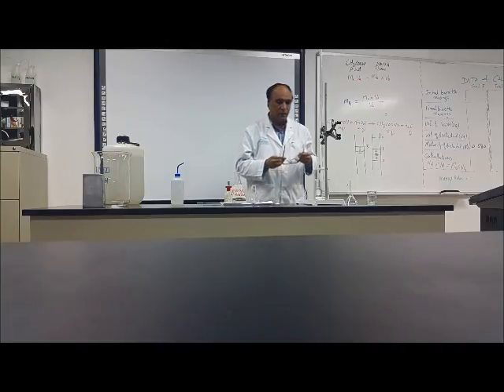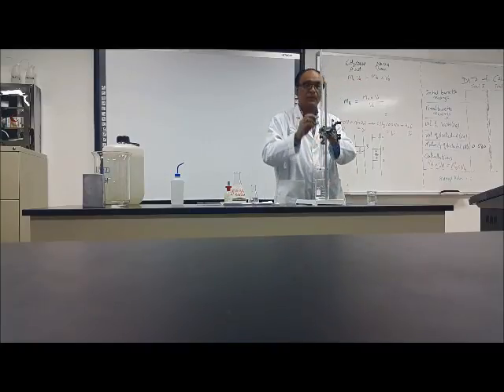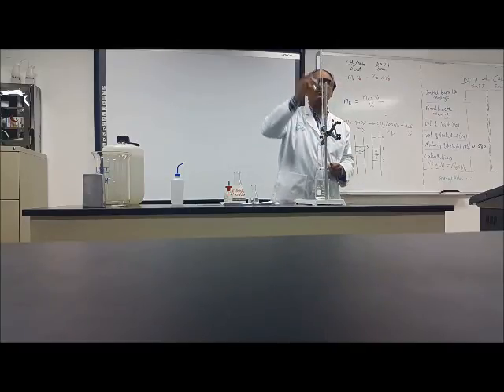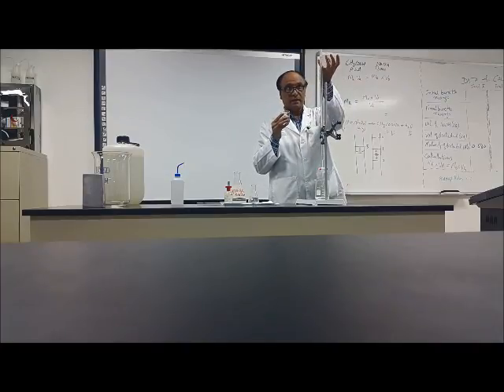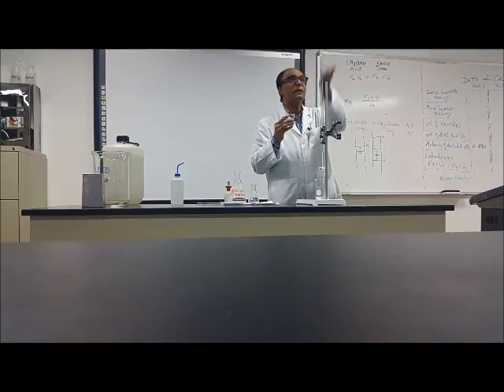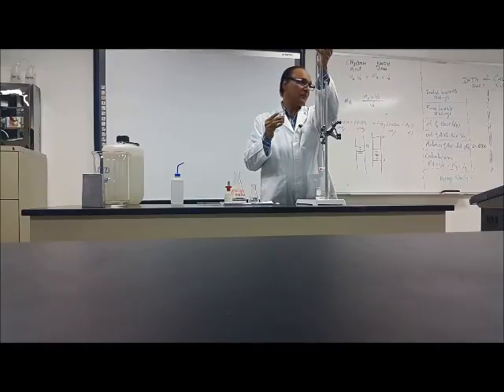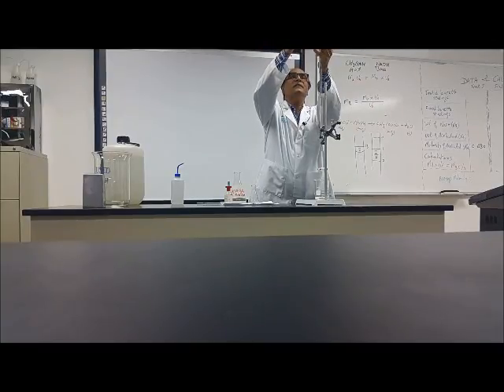Okay? Now, I close this one, put it over here, and I will put this one into it. You can see that there is a liquid. Actually, why is it there? Because there is air, and sometimes it bumps out. So what is the method? The method is to move it a little above with your finger. Did you understand? Move it above, and now you will see there will be no liquid staying there, because now the air can go from that place.